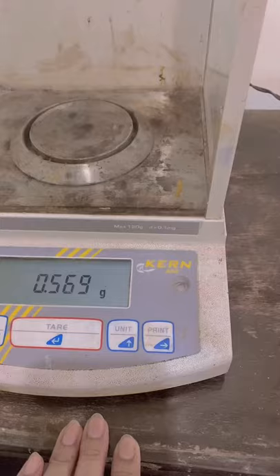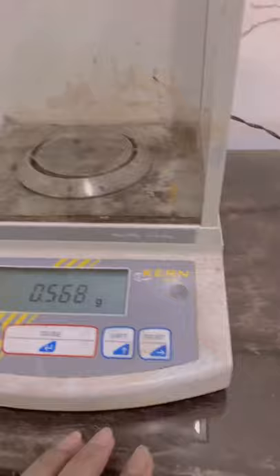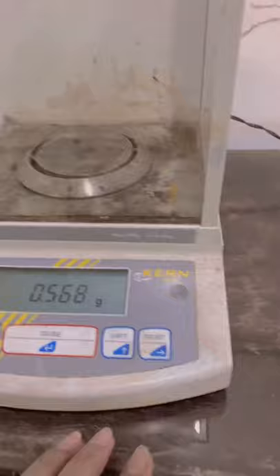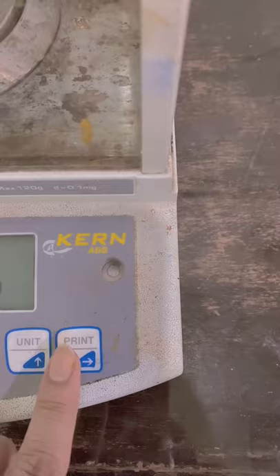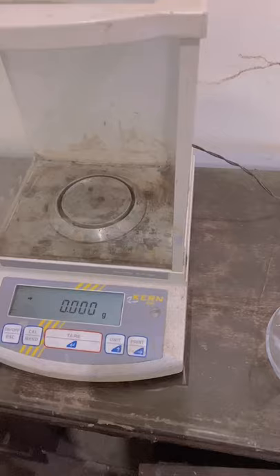The balance must be placed on a very plain, stable surface. There is a level indicator and adjustable feet to get reliable results. It also has a print option so we can take printouts. It works on the principle of magnetic force restoration, and it can measure solids, liquids, powders, and even granular substances like sugar.